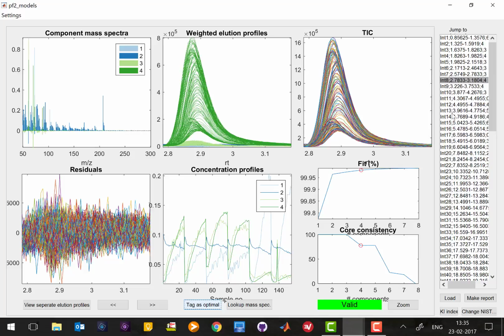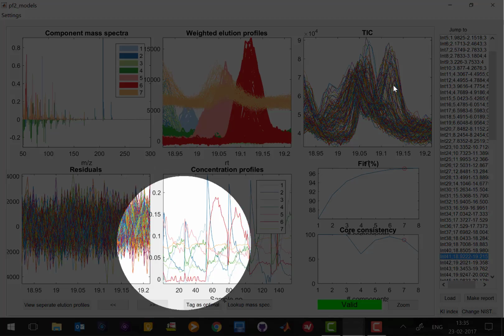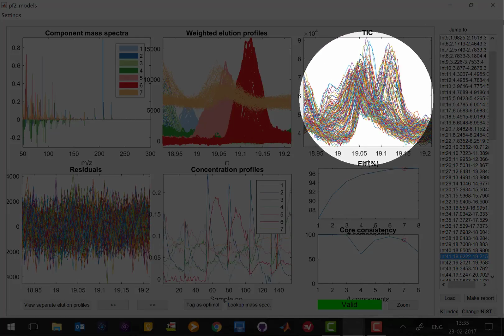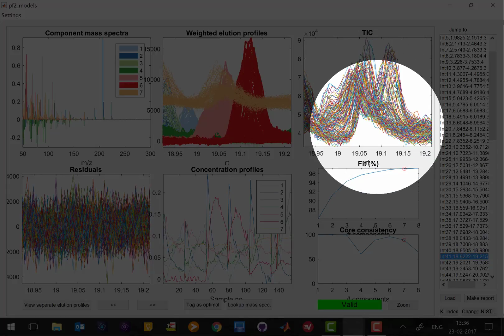We can do 41. Where's 41? 41. That's a more complex one. Let's see. Okay, now here you see some interesting things. First of all, you see that this is a very messy interval, and it could potentially be difficult. Maybe it could even be so difficult that it wouldn't work, and maybe you would have to take out a sub-interval. If I had been a little smarter, I guess I would have split this up in 2 or 3 intervals, but I didn't do that.